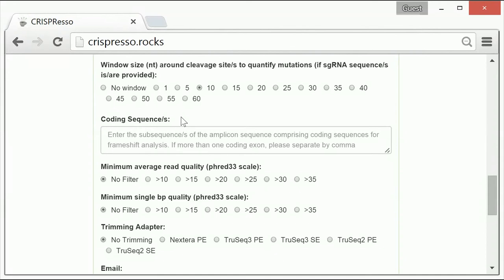The sequence must be a subset of the reference amplicon that was entered in the required parameters section above. If the reference amplicon contains multiple exons, they can be entered into the same field separated by commas.